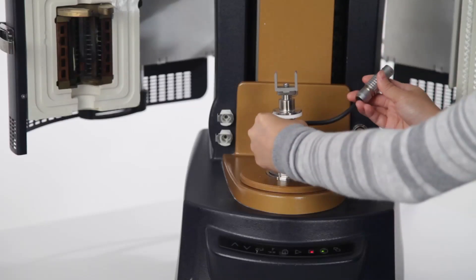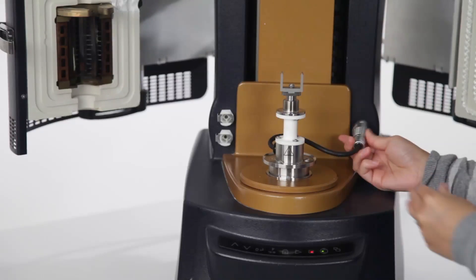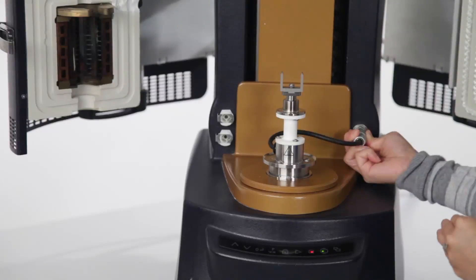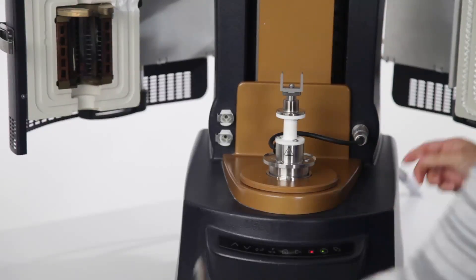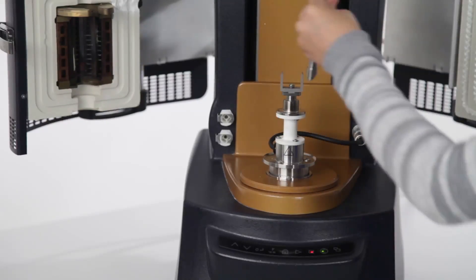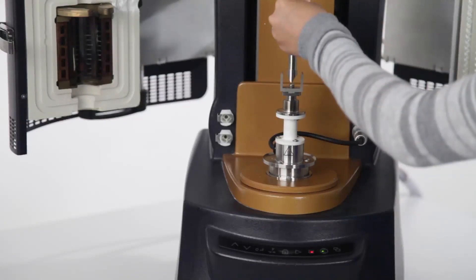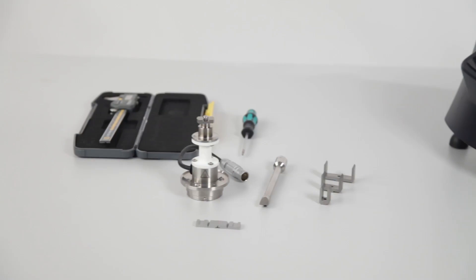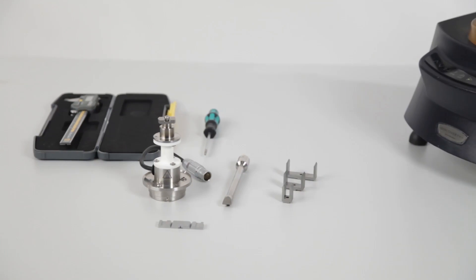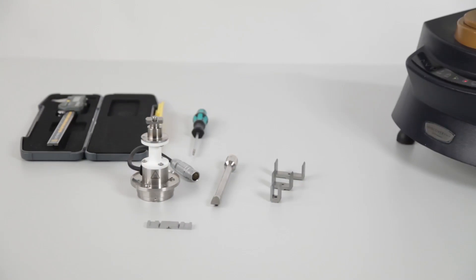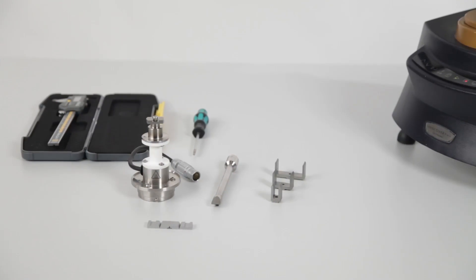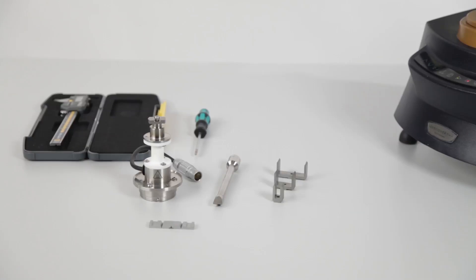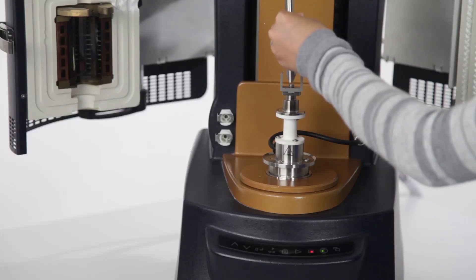When mounted on the DHR, the three-point bending clamp is used in tandem with the environmental test chamber for temperature control. The kit includes the upper and lower fixtures, an alignment tool, a screwdriver for switching frame sizes, calipers, and 10, 25, and 40 millimeter sized frames.